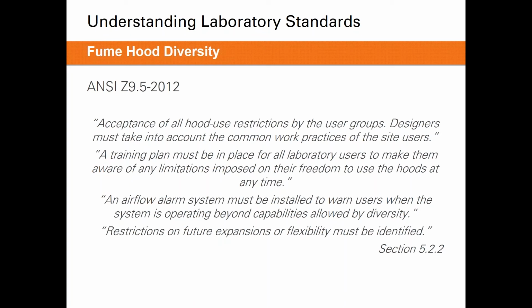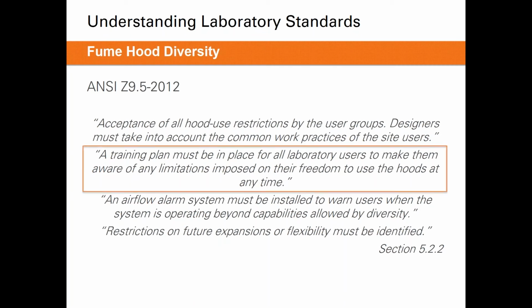The second one is very important here as well, is that a training plan must be in place for all the laboratory users to make them aware of any limitations imposed on their freedom to use the hoods at any time. So if we do have a condition where we can only use 50% of the hoods in the lab at any given time, then we do need to make sure that there's a training plan in place for anybody who will be in the room to make sure that they don't open 75 or 100% of the fume hoods.